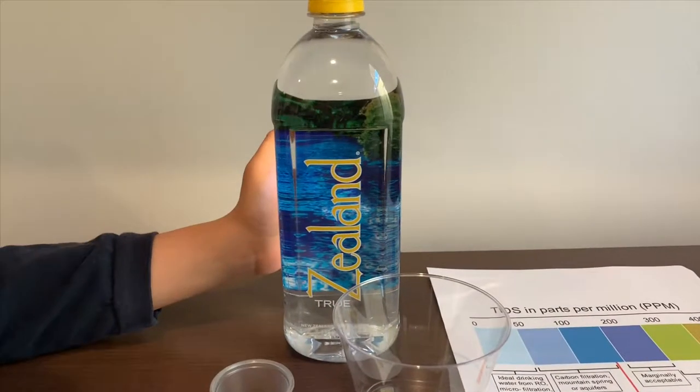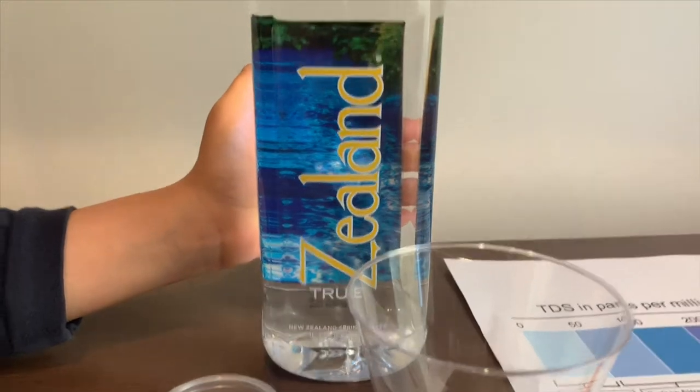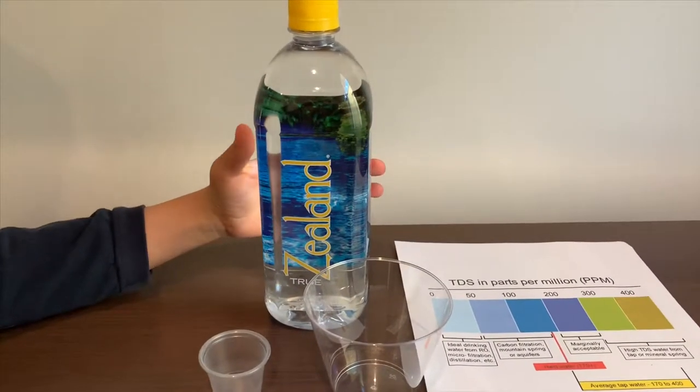This is True Zealand Natural Spring Water. It's sourced from New Zealand and it costs $1.79. Let's test the pH and TDS levels.